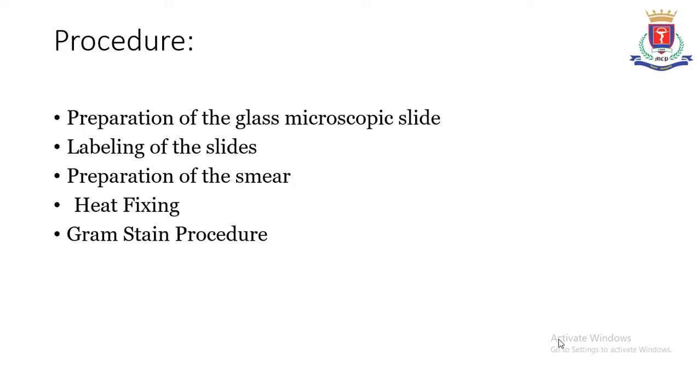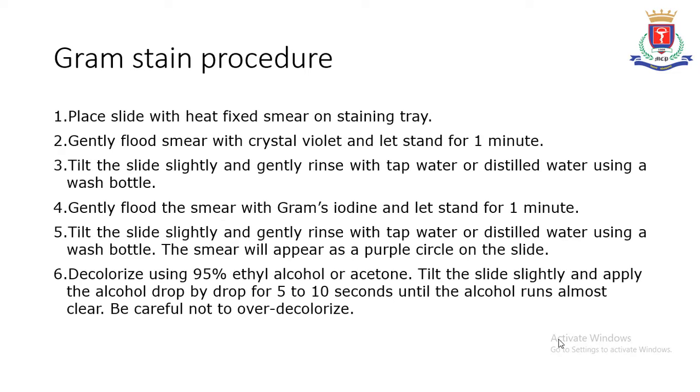Allow it to dry, and after that you have to heat fix that smear, and then you will have to follow the gram stain procedure. So we'll be seeing what is the gram stain procedure. First we will place the slide which is containing the heat fixed smear on a staining tray.